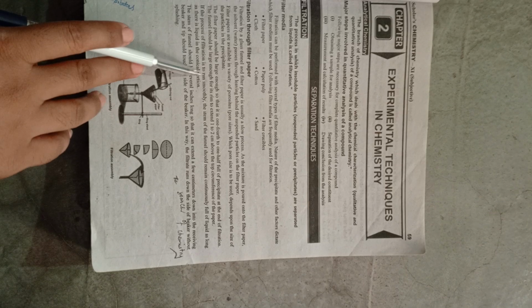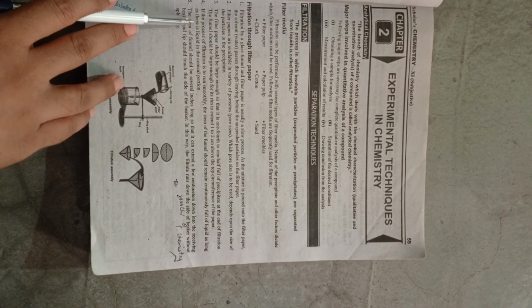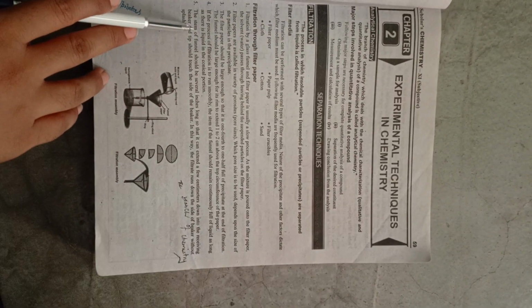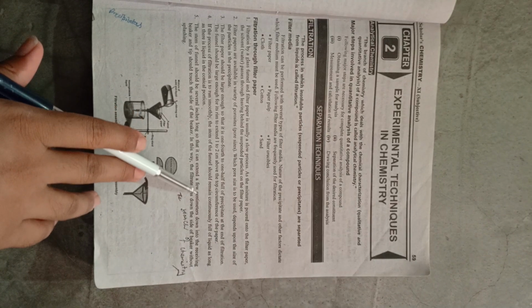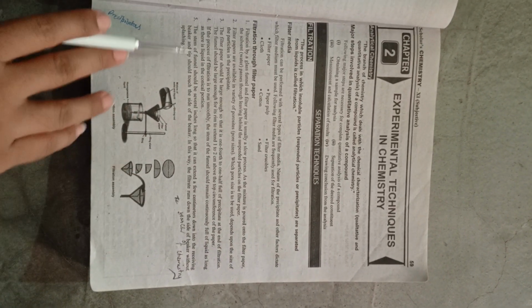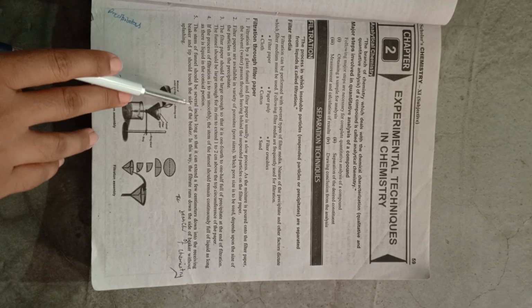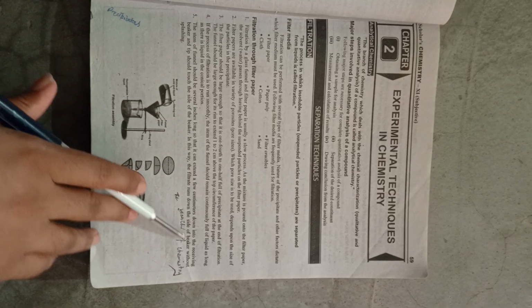If the process of filtration is to run smoothly, the stem of the funnel should remain continuously full of liquid as long as there is liquid in the conical portion. The stem of the funnel should be several inches long so that it extends a few centimeters down into the receiving beaker, and the tip should touch the side of the beaker. In this way, the filtrate runs down the side of the beaker without splashing.